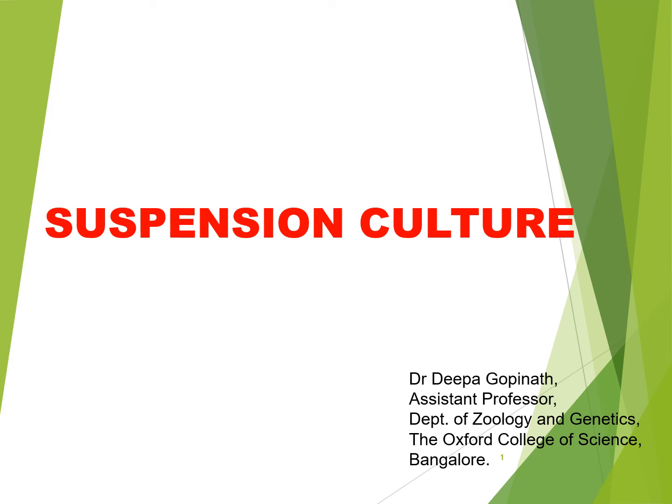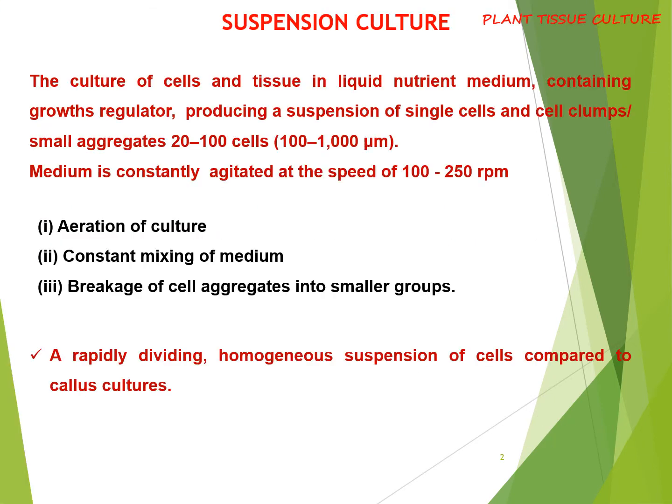The topic is plant cell suspension culture. Suspension culture refers to the growth of cells or tissues in liquid nutrient media containing growth hormones. The media is constantly agitated at a medium speed. It allows the uniform distribution of nutrients and aeration to the cell or cell aggregates. It also breaks the cell aggregates into small groups and removes any polarity of the cells.